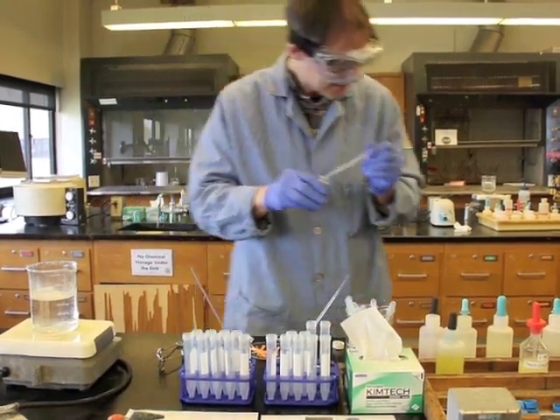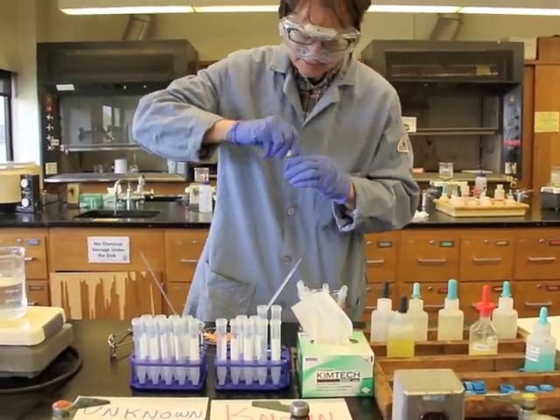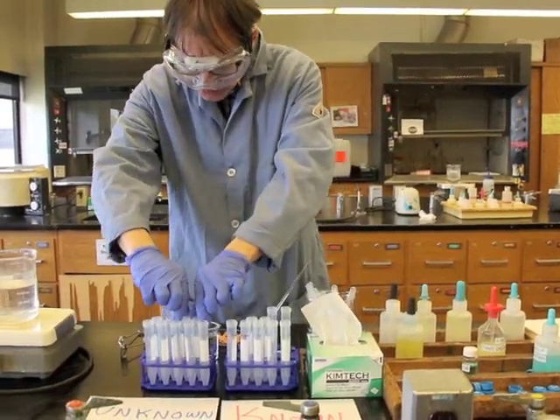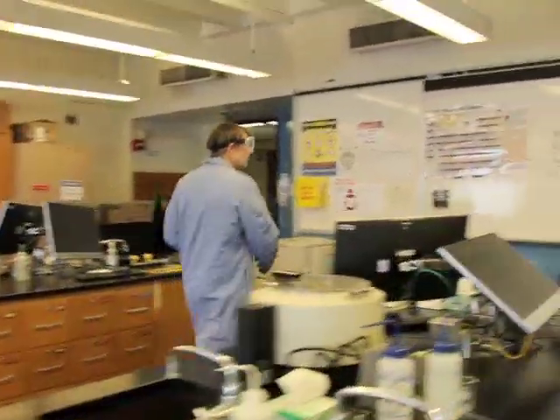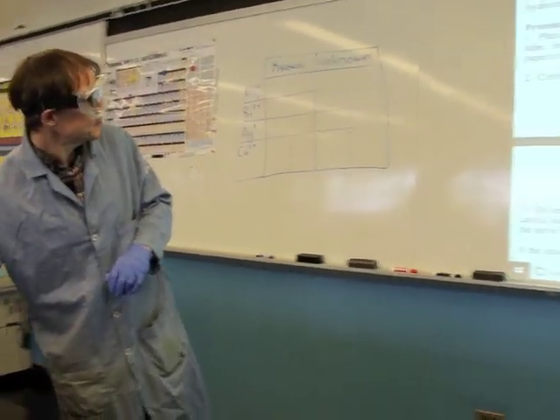Okay. All right, there we have that. We're going to analyze both of these. So I'm going to move these 2 test tubes up here so that we know what we have. Okay, so now we're ready for what's called the confirmation of ammonium, NH4+.